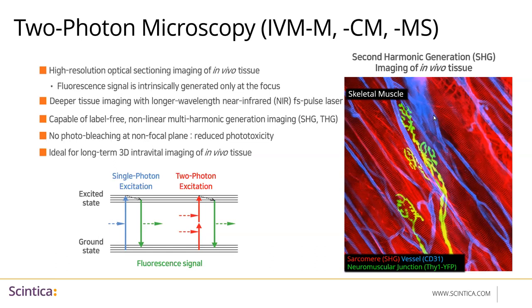A great feature of two-photon is that with a Chameleon laser, it gives you the ability for label-free imaging via second harmonic generation. Second harmonic generation is usually used to look at fibrous tissue — such as bone and muscle — as it shows fibers very well. In this example, we have imaged muscle; you will see the sarcomere visualized by second harmonic generation, vessels in CD31 blue, and the neuromuscular junction in yellow.